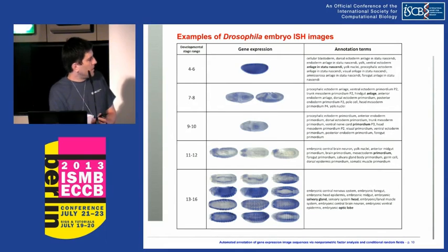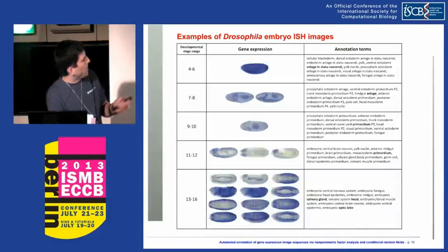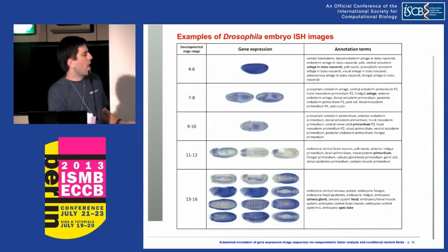Now, this is just one last example before I go to the actual analysis. I'm showing one gene and the registered images. This is one image from stage 4-6, and you can see later specialists would have to acquire maybe 12, 15 images because more processes are happening, and they would like to analyze those in more detail.